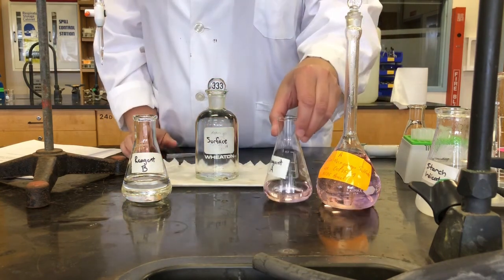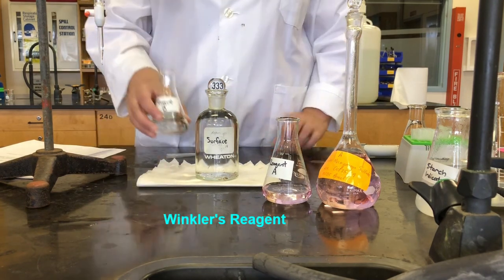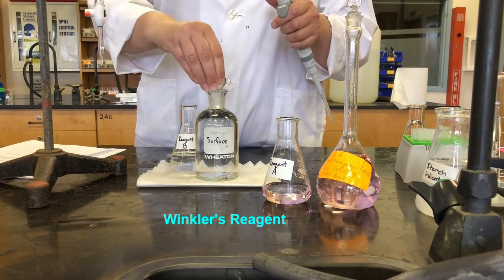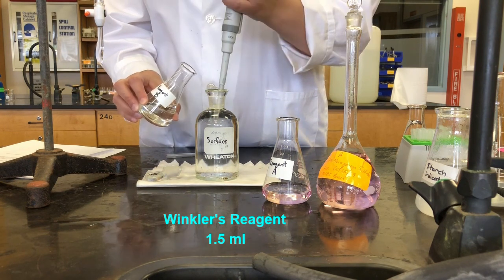And the next reagent that we add is the actual Winkler reagent. So that's reagent B, and it's the same amount, so 0.5 for every 100 mL of sample. So again, we're going to add 1.5. So there's 0.5.